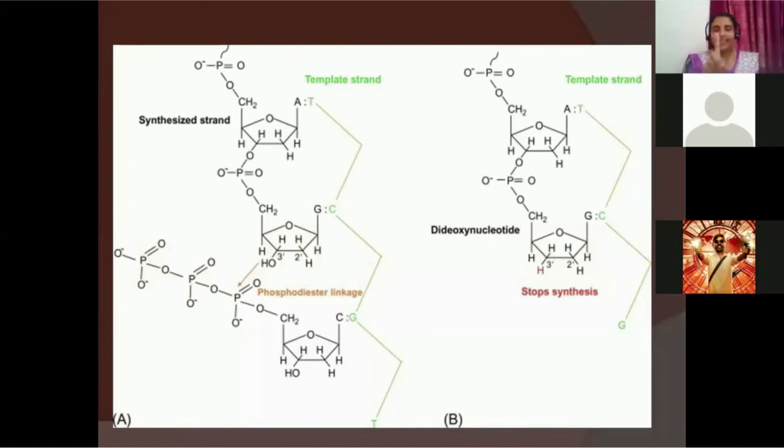So I take one strand, that is called the template strand. In this diagram, this line shows the template strand. They have not drawn the bases here, they've just represented it with a line. Now, if in the template strand there is a thymine here, what will come and join? Adenine. So your adenine nucleotide is coming and joining. Okay, A has joined. Now the next base is C, cytosine. So which will come and join? Guanine will come and join. So your nucleotide with guanine has joined.